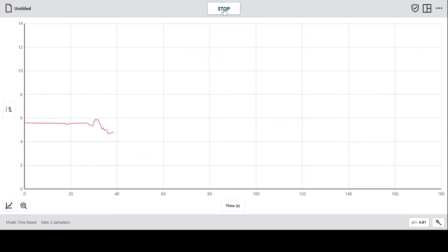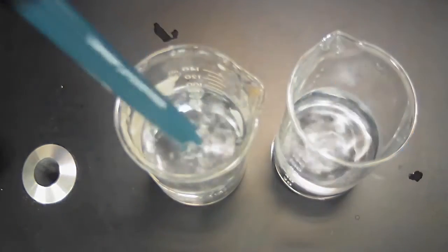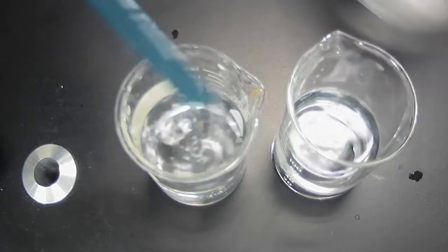Okay, and here is now the pH of the carbonated water, which you see drops quite a bit, by about a full point on the pH scale, which remember is times 10, right? So our carbonated water is going to have 10 times the hydrogen ions inside of it. Remember, that's what it means as you go down the pH scale. All right, and so now we'll come back to our main solutions. Okay, and Mrs. V, I'm going to take it away.